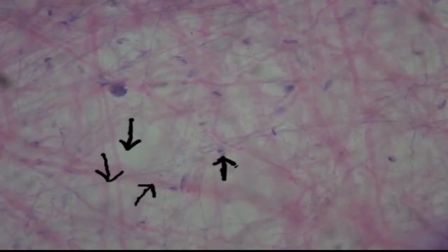And the last thing you should identify are the different types of cells inside the areolar connective tissue. So the nuclei of the cells were stained purple, and you could see the different cells throughout the connective tissue and how they're spaced apart. So the cells are not touching in this extracellular matrix.